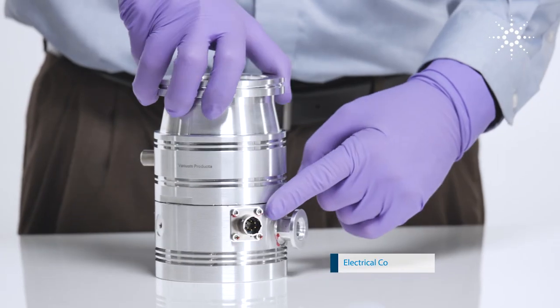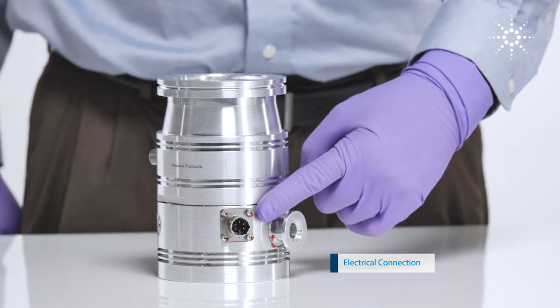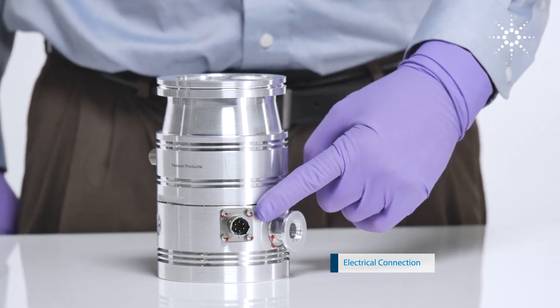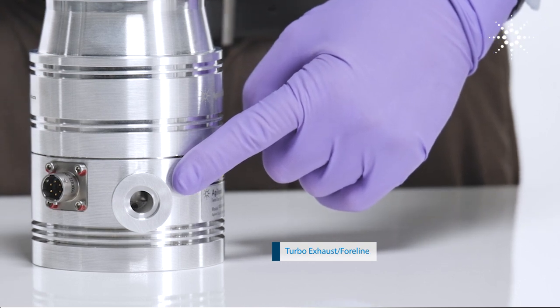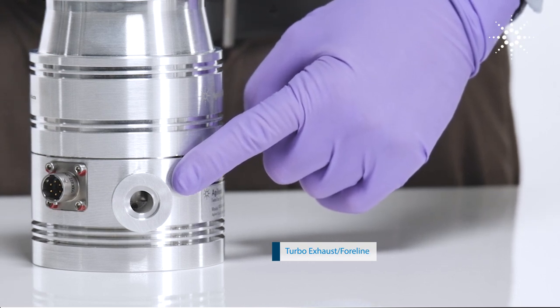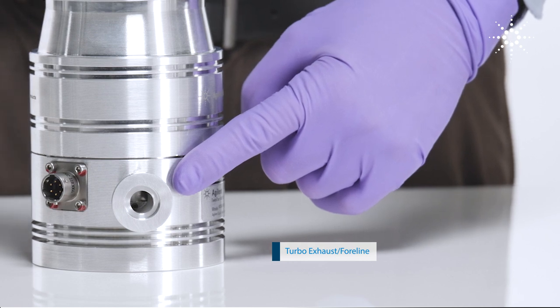The electrical connection here provides power from the turbo's electronic controller to the pump motor. Here is the exhaust of the turbo, also known as the foreline, which will need to be connected to a rough vacuum pump, usually referred to as a backing pump.